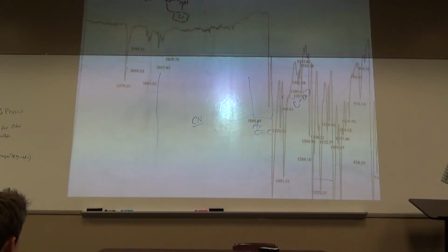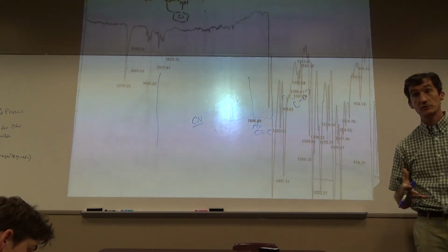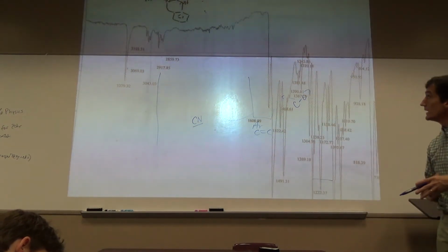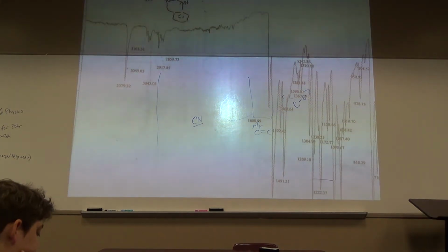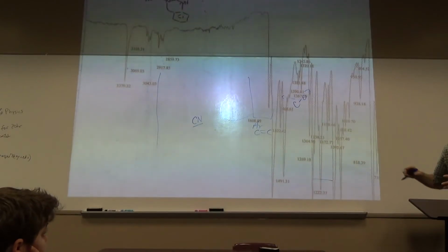Could it be? Now there's only one NH. Sometimes when we did this reaction, we did IR, and there were two NHs, and it looks like still starting material. It didn't do anything. IR is real quick and easy to run. It's okay, we have compounds. And if you look at the fingerprints, they're certainly different too.